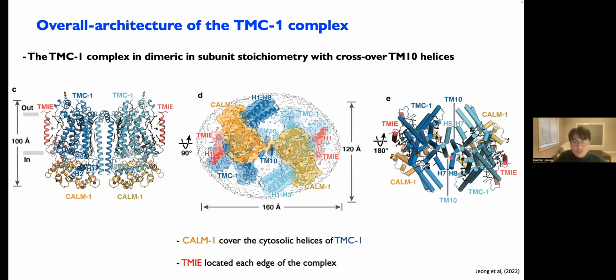And interestingly, the last transmembrane helix, TM10 of TMC1, forms a domain-swapped structure in this complex.